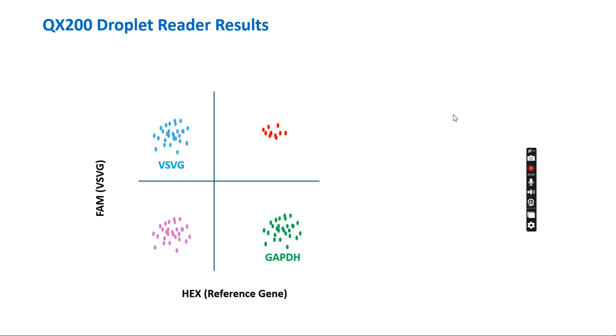So VSVG is not good at that point, because we don't want to see the viral particles or viral envelope gene still in my product. So we shouldn't see these results, to be honest, in the lab. We should see there is no VSVG in my samples. That would be the successful criteria to pass our CAR-T or gene therapy product.